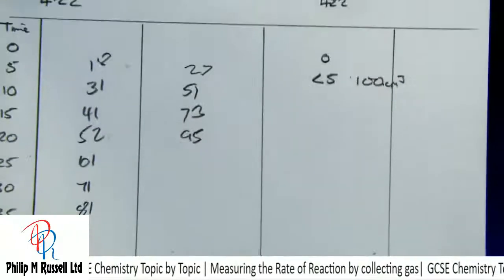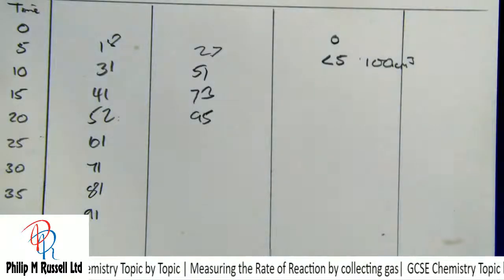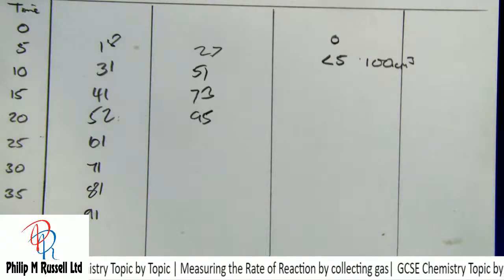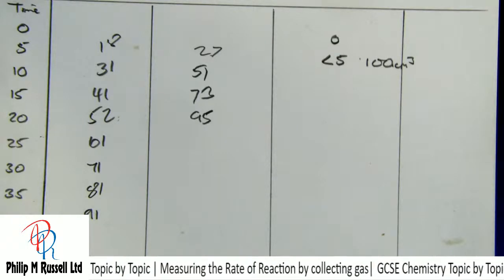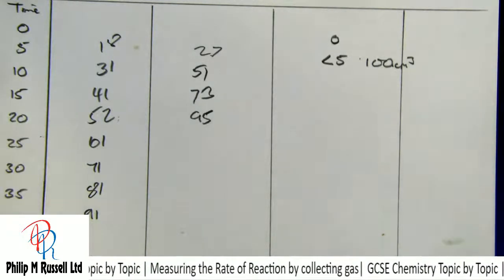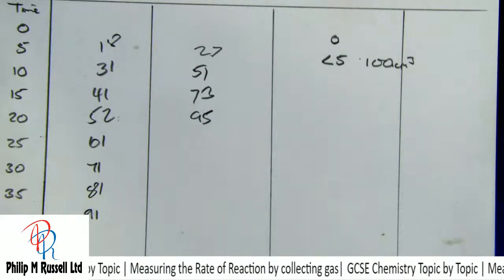Here are my results. They weren't very much, they went very quickly. Just grabbing some graph paper and we'll see what we've got.